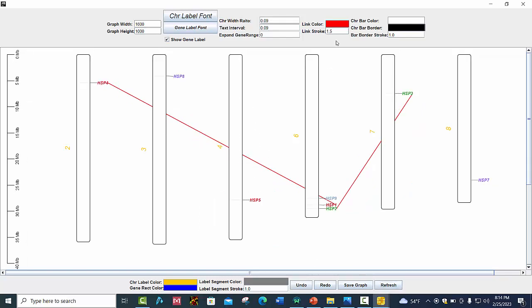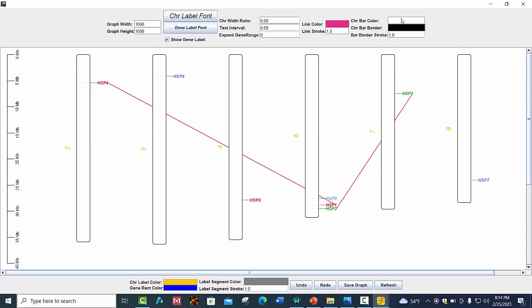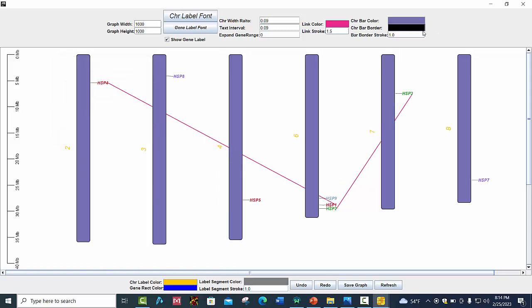You can also change the link color, and you can also change the chromosome bar color and chromosome border color.